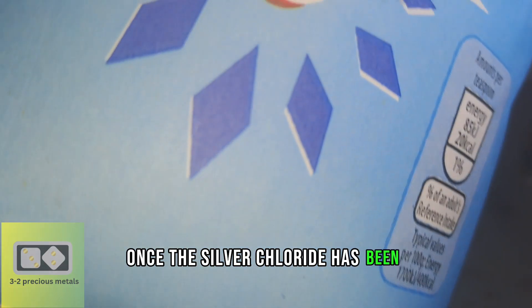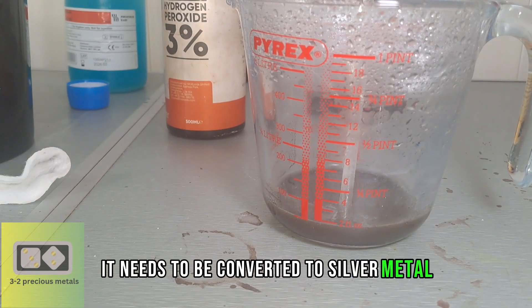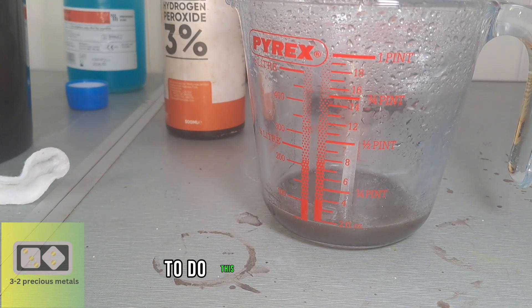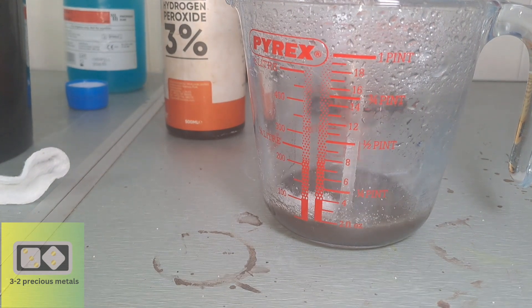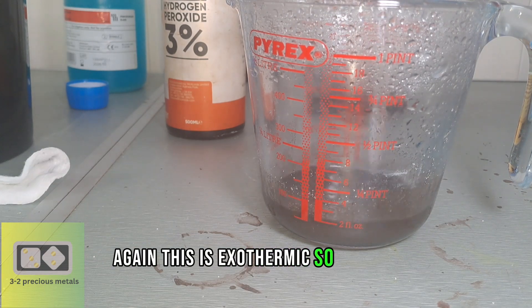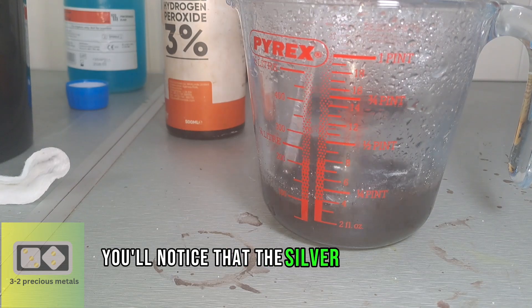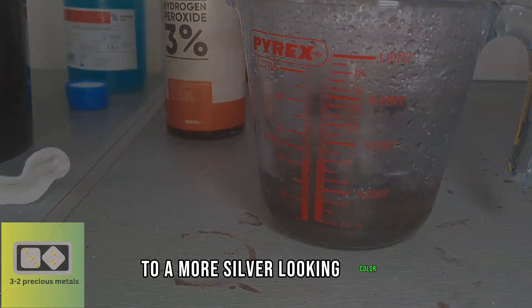Once the silver chloride has been converted to silver oxide, it needs to be converted to silver metal. To do this, just add sugar. Again, this is exothermic, so please be careful. You'll notice that the silver oxide goes from black to a more silver looking color.